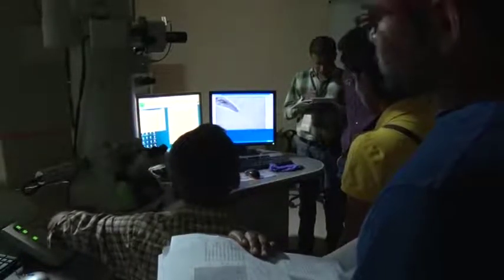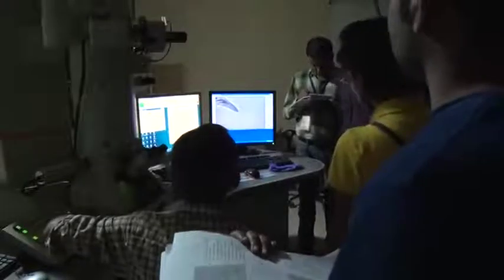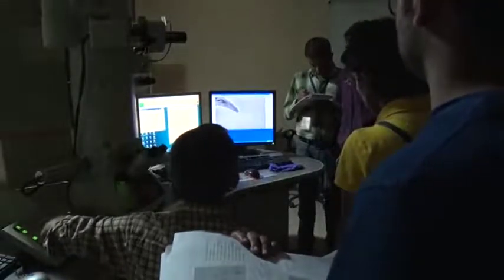Yeah, something like this. Maybe one can try again. So this is the process. Whenever you have access to the microscope, you can always try it. But this is the simple process. So this looks pretty fine, isn't it? So I stop the high tension wobbler.